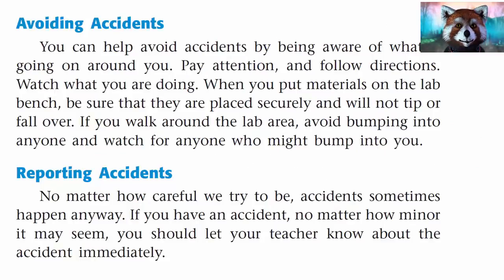Avoiding accidents. You can help avoid accidents by being aware of what is going on around you. Pay attention and follow directions. Watch what you are doing. When you put materials on the lab bench, be sure that they are placed securely and will not tip or fall over. If you walk around the lab area, avoid bumping into anyone and watch for anyone who might bump into you.